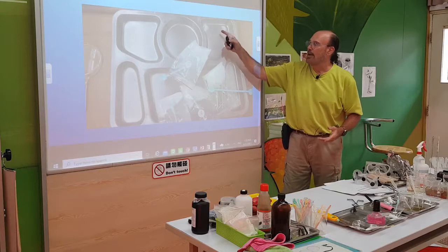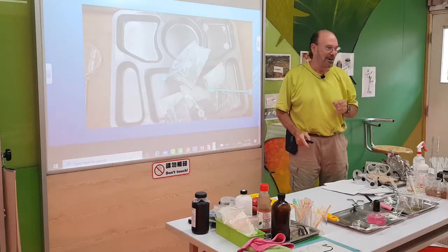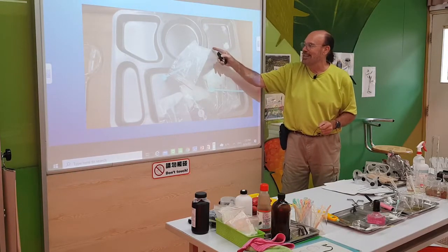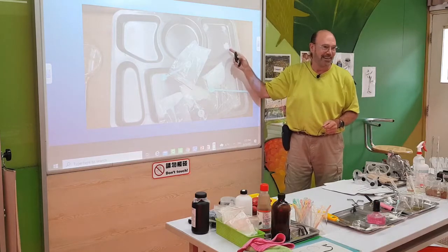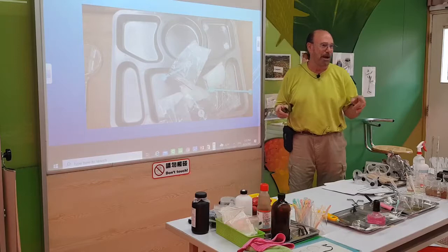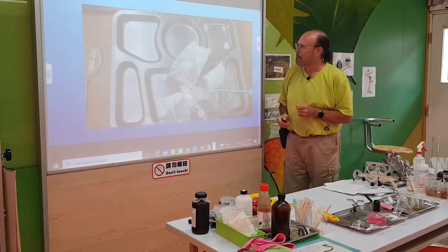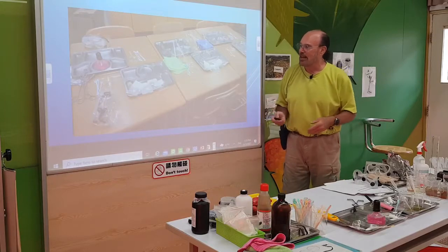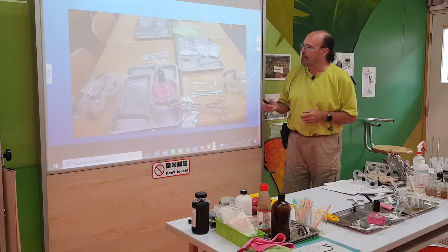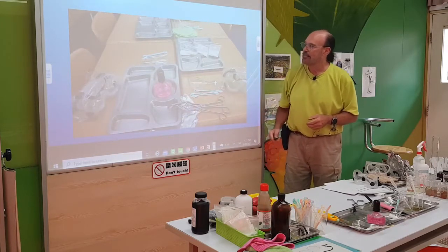We put them on the tray. When you put them on the tray, remember which one is which. Okay, so I like to go A, B, and C here, not here. Or if I forgot which one. So just kind of help each other remember, so you don't forget which is which. And that's just a setup of the entire lab when I have students working. And there's the substances, the stirrers, and the heat test.